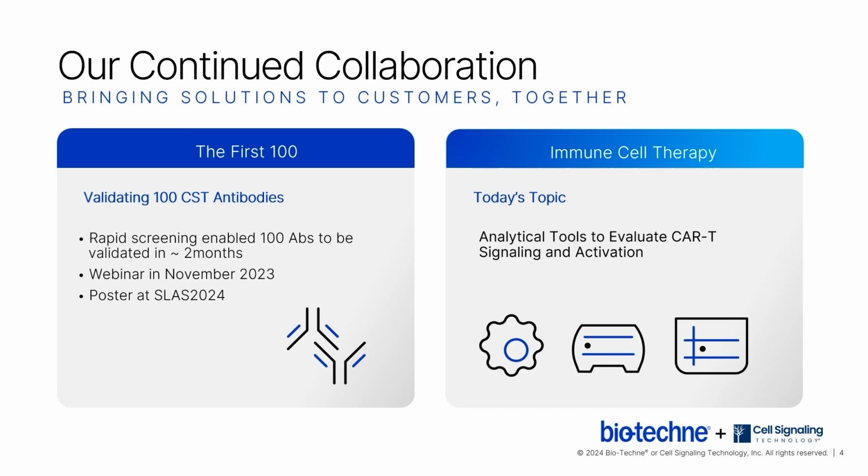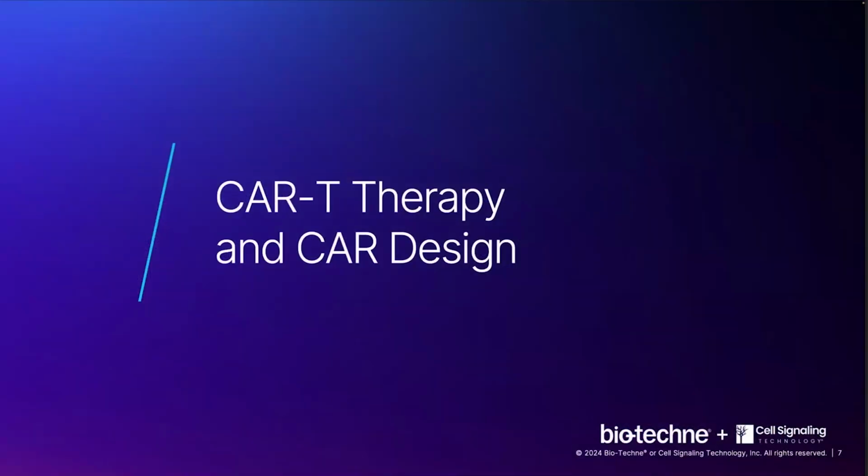We will discuss our analytical tools to evaluate CAR T signaling and activation, and we think you'll walk away with a great understanding of autologous CAR therapy, how we can rapidly make CD19 CARs, and how we can easily characterize them using two analytical platforms from Biotechne and antibodies from Cell Signaling Technology. Now we're going to dive into some background about CAR T therapy and CAR design.